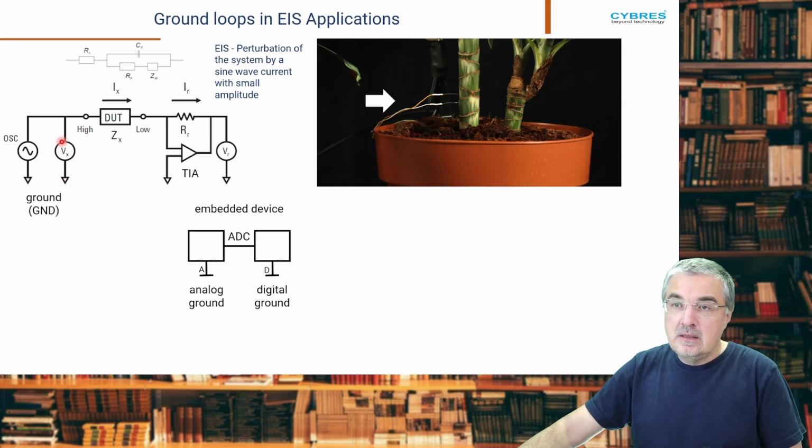You can think that the element producing this high potential is a normal power supply unit. You have plus here, minus here, and this ground line works like a minus for your system. Same way here in the measurement part, this transimpedance amplifier converting current into potential does this in regard to this ground signal. The point is, if this ground signal is changing, all these potentials will be changing, and you will see different results in your measurements.